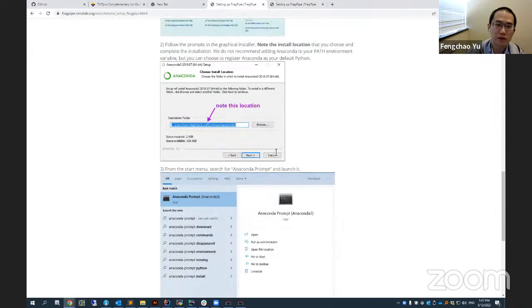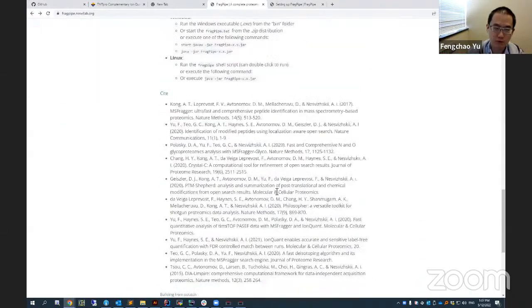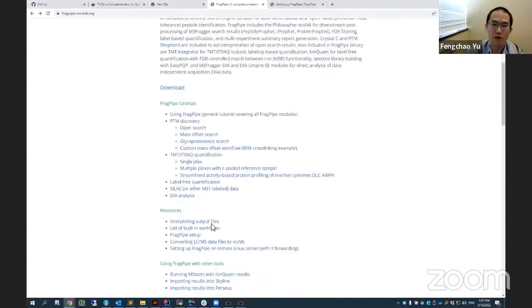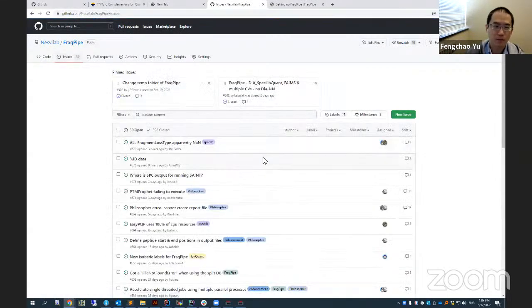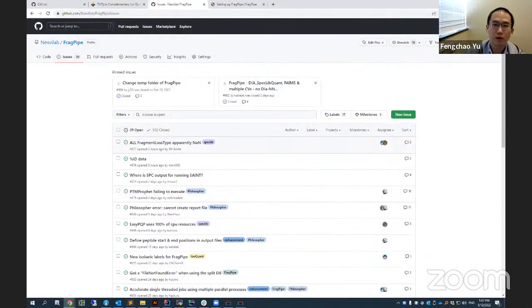So yeah, this GitHub landing page has a lot of resources, and you can learn pretty much almost all the basic stuff by reading those pages. And if you still have questions, as Philip showed, you can ask a question here by creating issues. So yeah, we will normally respond very promptly.